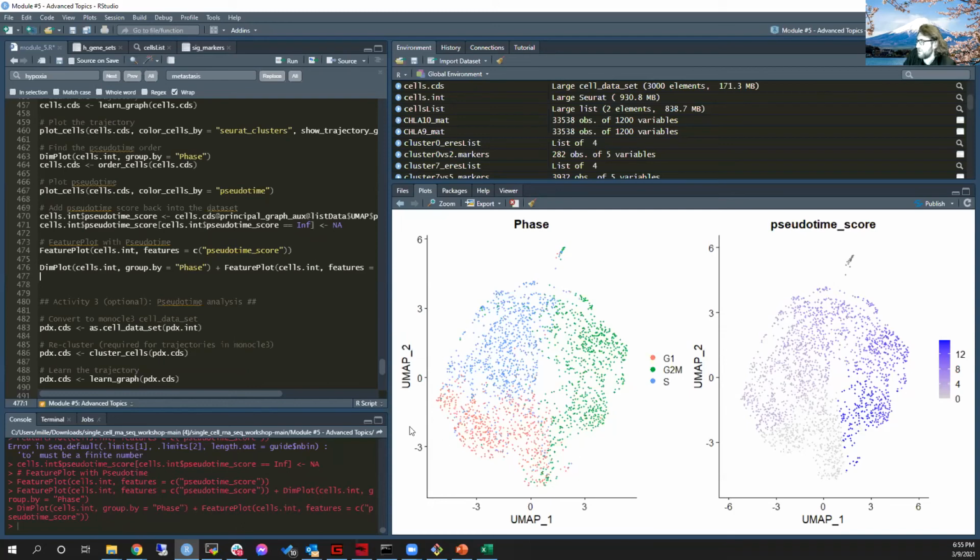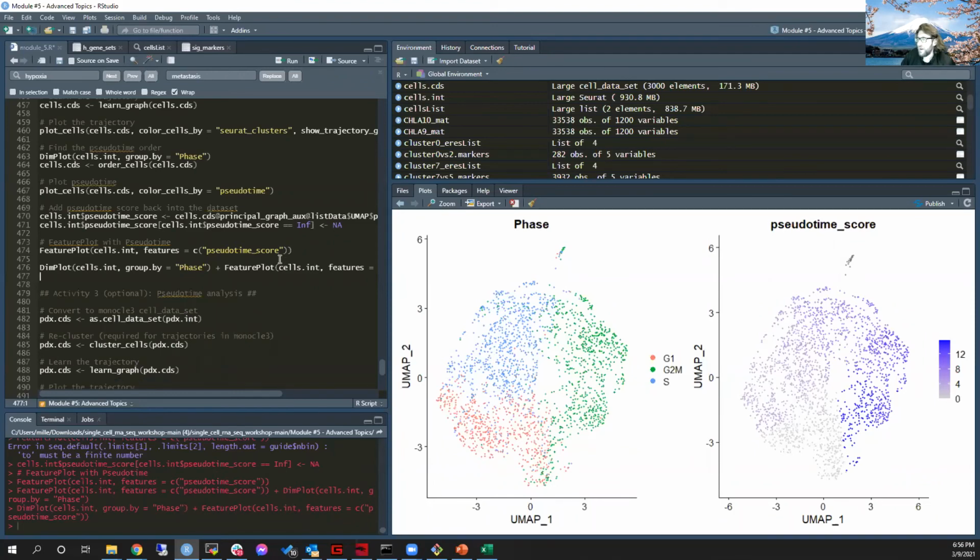So when we do this graph construction here, even though UMAP does embed this as a circle, and even though the graph does contain a circle within it, the trajectory analysis does not have the ability to recognize that you're actually going back to where you started once you get here. So kind of interesting. I don't know. Kind of highlights how each different approach makes different assumptions.